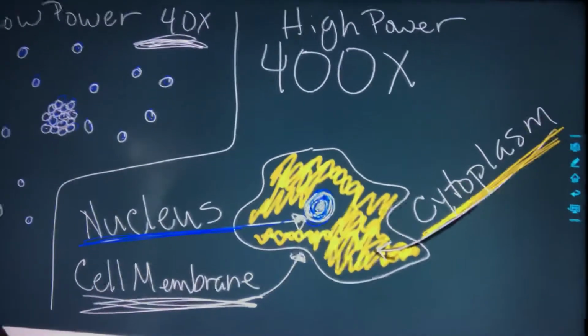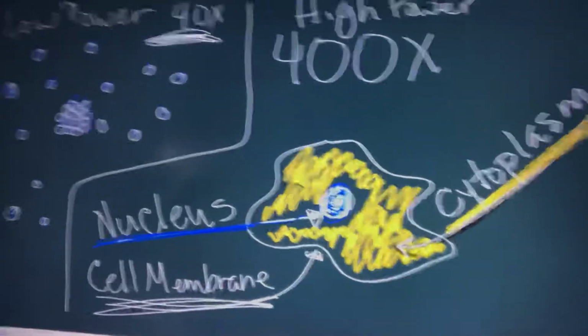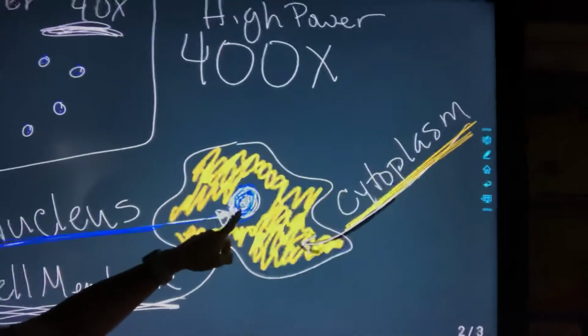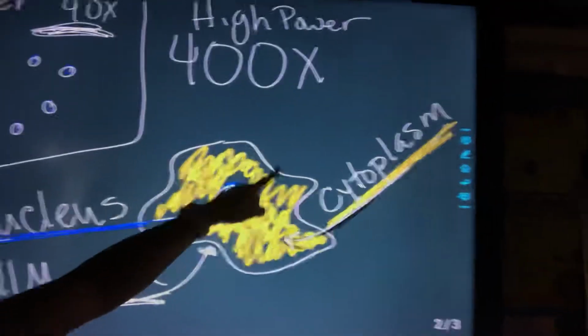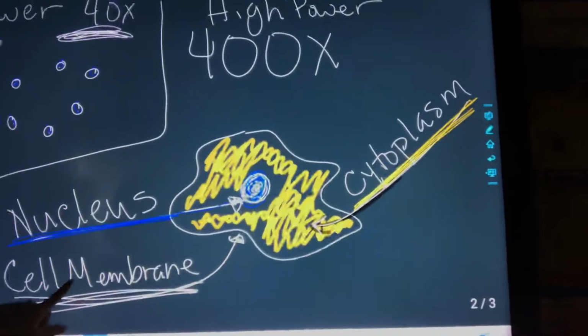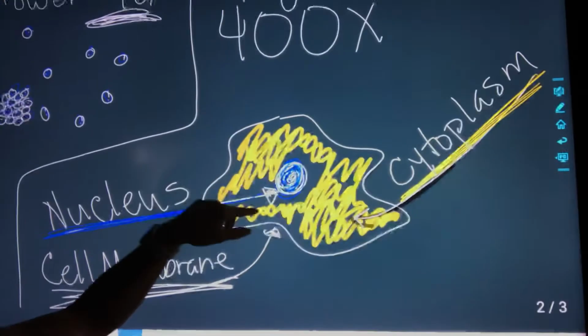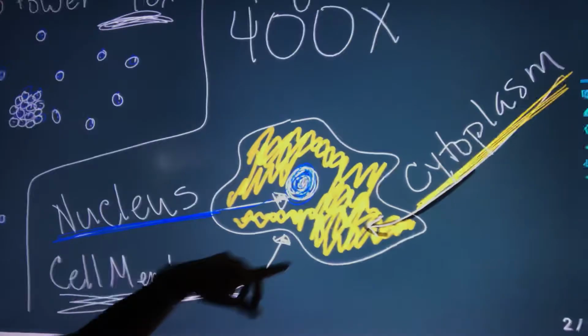You need to label 3 parts, and I want you to use different colors so I know you know what you're identifying. So again, I know it's backwards, but like the nucleus would be in the center. It's like the yolk of a fried egg. The outline of the egg is the cell membrane. And then all the gel that's inside that you may not really be able to see, but we dyed it blue in our lab on campus, that's the cytoplasm. So I hope that helps a little bit for the animal cell, that's your human cheek cell.